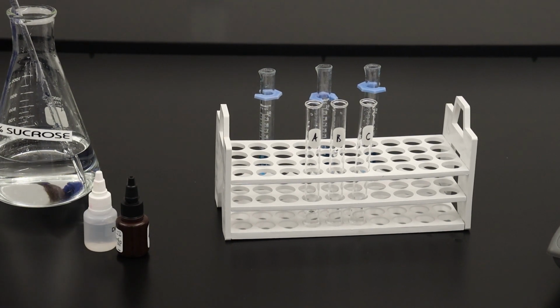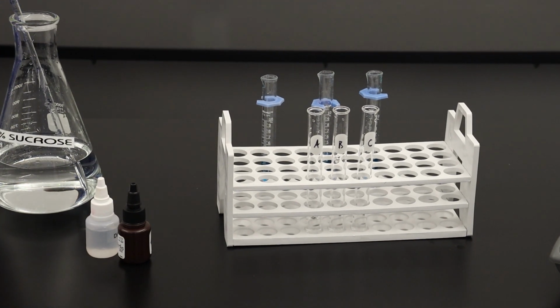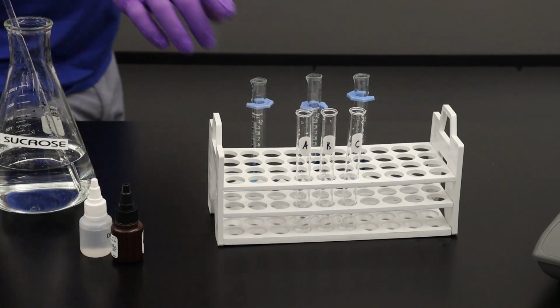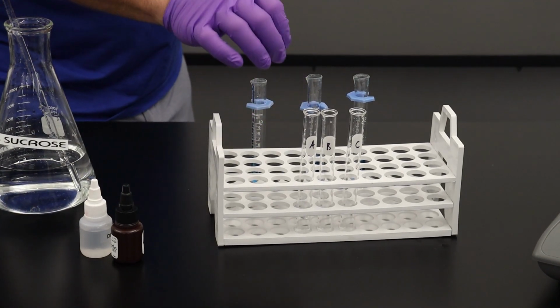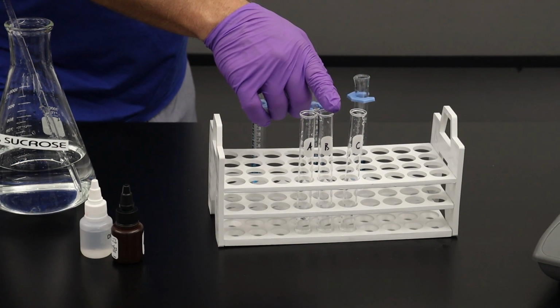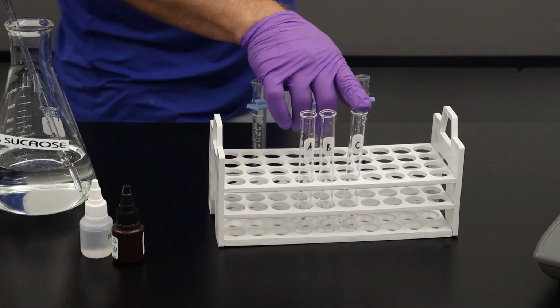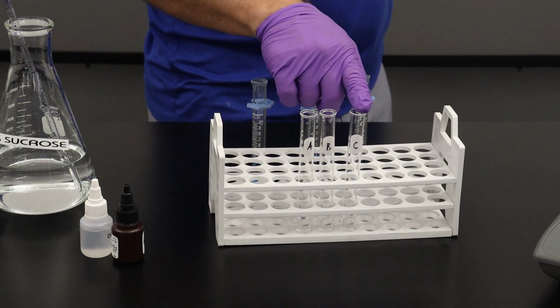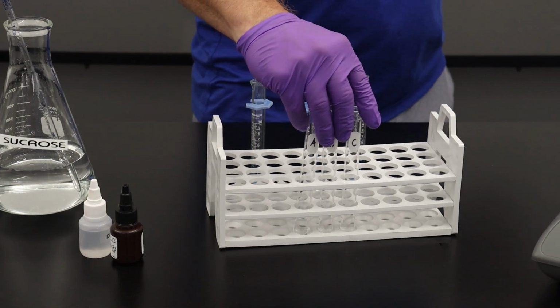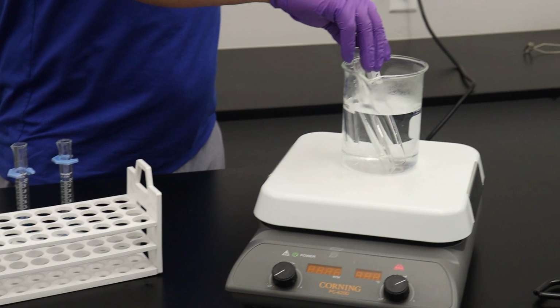Now that we have our solutions made, we should take a look at what we have in each test tube. In test tube A, we have sucrose and acid. In test tube B, we have sucrose without acid, and in test tube C, we have acid without sucrose, so acid and distilled water. Now we need to put them into the warm bath and allow them to boil for 4 minutes.